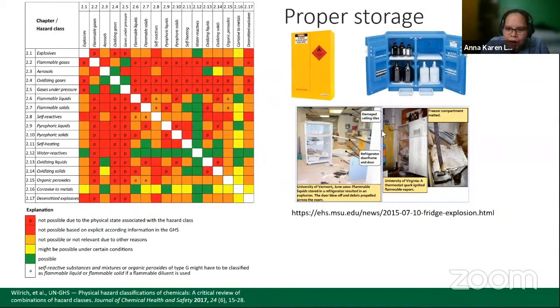In terms of compounds or chemicals that have to be refrigerated, you have to make use of explosion proof refrigerators. So you cannot just use your usual household refrigerators. Those Kelvinator, Samsung, Condura, or Frigidaire fridges we have at home are not suitable for chemicals. You have to get refrigerators that are suitable for the lab, the explosion proof ones.